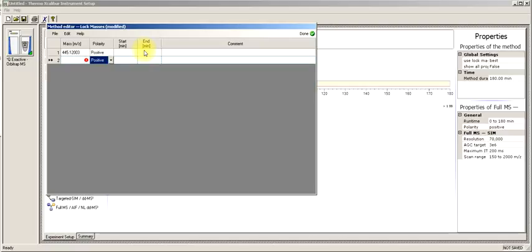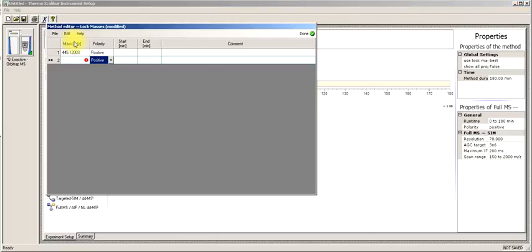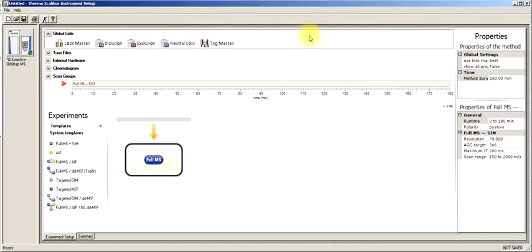If it does not see this ion, it doesn't care. It's just going to go with the last calibration, the last time it saw it. And like the Orbitrap Elite, adding a lock mass adds no extra time to your measurements. You're not slowing down the instrument or increasing your cycle time. Just put that in here. You can save anything under global here, and import and export, but in most cases, just save it into the method here.